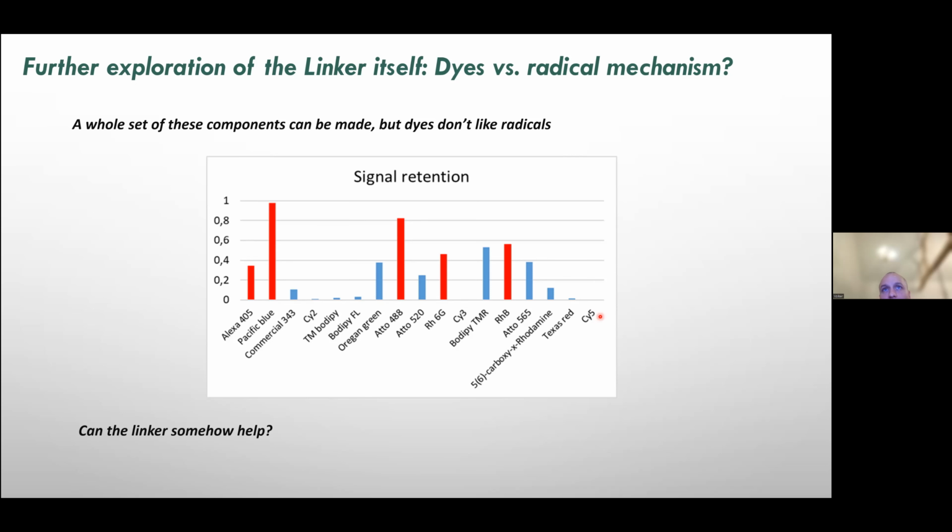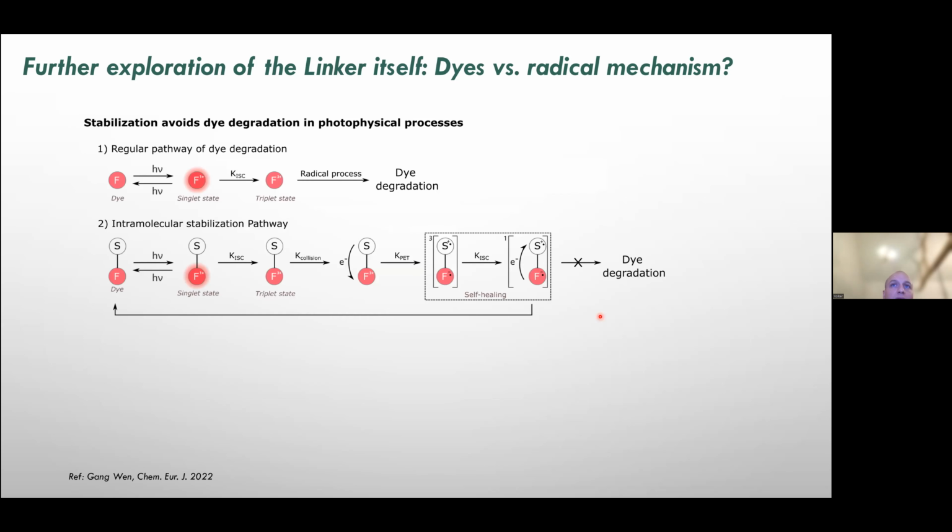There's very sound chemical reasoning behind this. It has to do with double bonds on the system themselves that do like the polymerization process themselves, and they will polymerize and lose their chromophore. So we thought you have similar concepts in dyes, where you have a dye that can be self-healed by having something that can quench the radical or capture the radical and recover the dye.